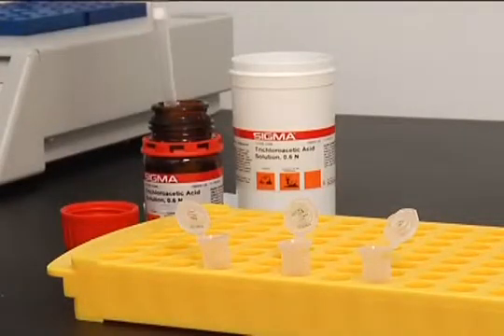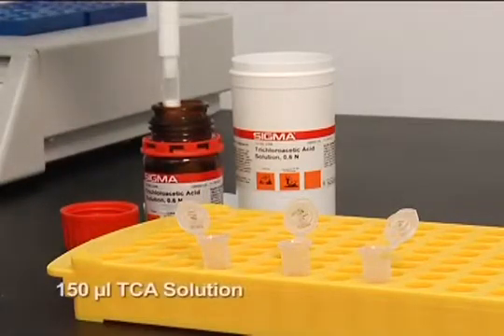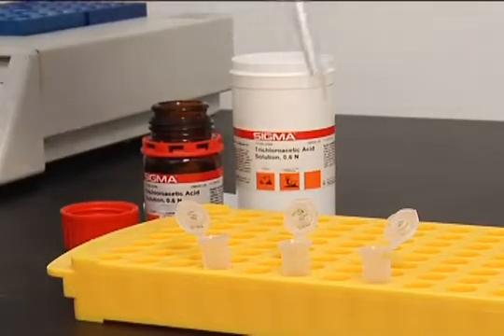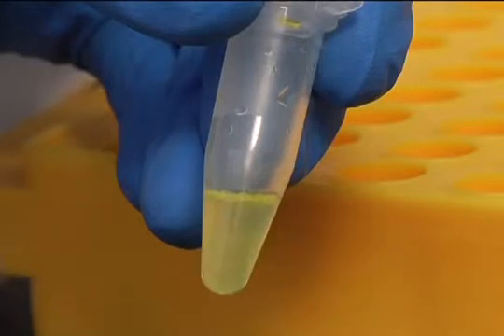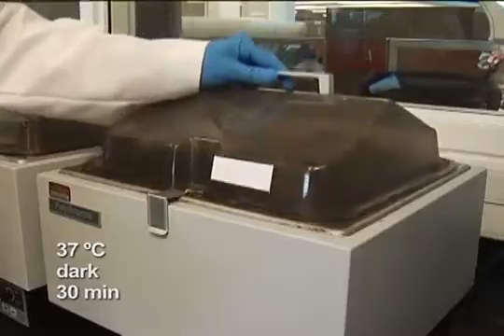When the incubation is complete, use appropriate protective equipment to add 150 microliters of the TCA solution to each microcentrifuge tube. Upon incubation with TCA, one should observe a white haze present in the tube, which is the precipitated, undigested, and insoluble casein. Mix gently and incubate at 37 degrees Celsius in the dark for 30 minutes.